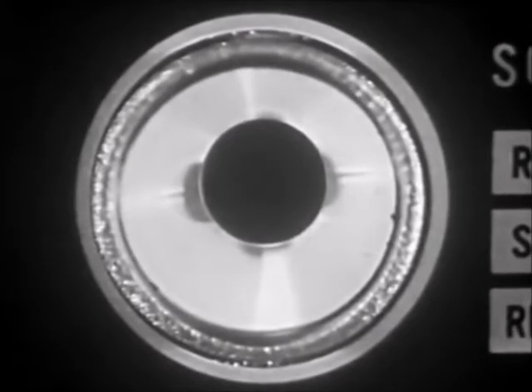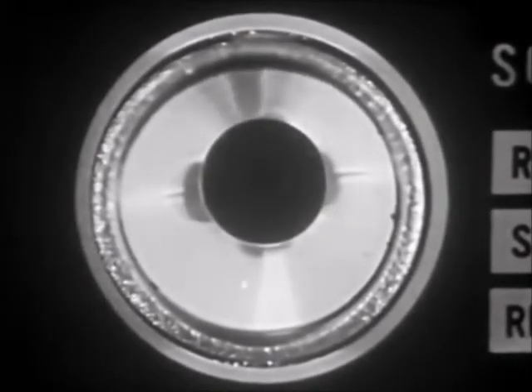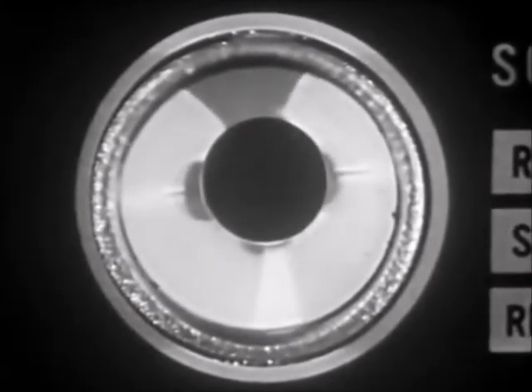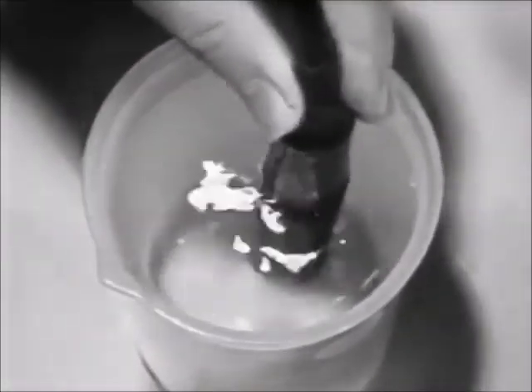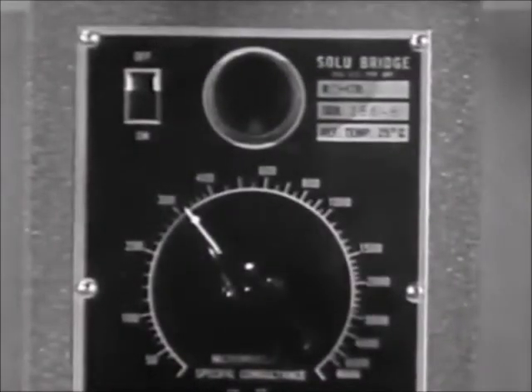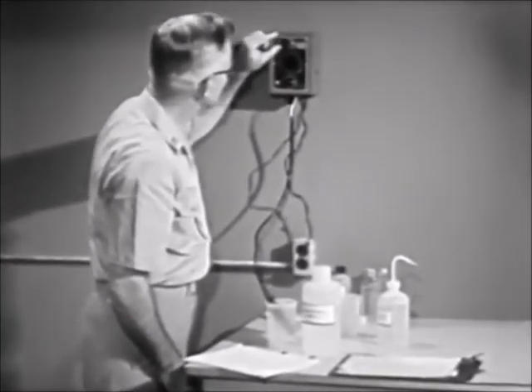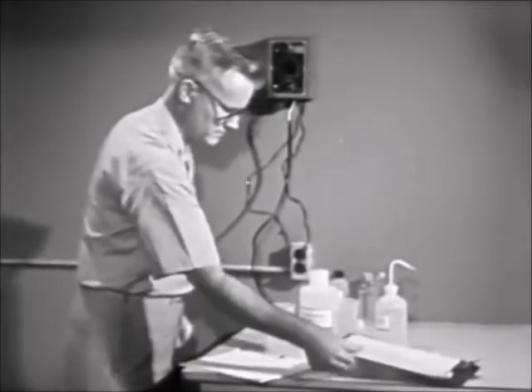Rotate the upper dial until the tuning eye deflects to the widest possible angle with sharply defined lines. It may appear far out of balance, then approaching balance, and finally correctly balanced. When the tuning eye has been balanced, move the cell up and down a few times — the tuning eye should remain balanced. If it does not, readjust as necessary. Turn off the meter and record the conductivity reading, measured in micromhos per centimeter, on the required water treatment logs.